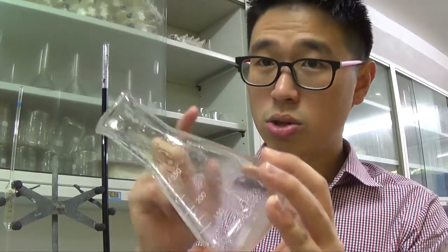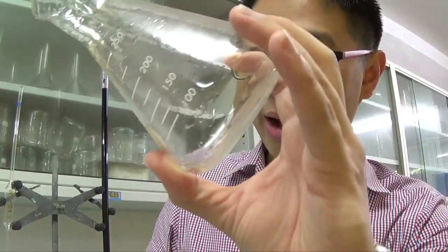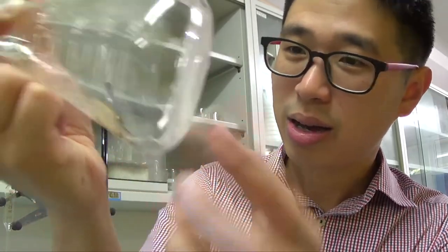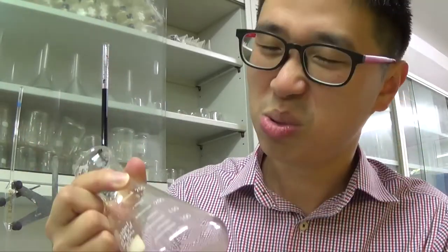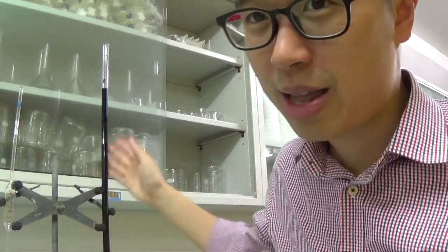So sometimes they do ask you, is it important? Should you wash this with distilled water or should you wash it with the solution R? If you wash it with solution R, then you will be left with a little bit of solution R. That means if you have a little bit of this, which is solution R, when I prepared in the right amount of R, which is the iron 2, then I will have just a bit more of the iron 2. When I have just a bit more of the iron 2, then my end point will be slightly higher.